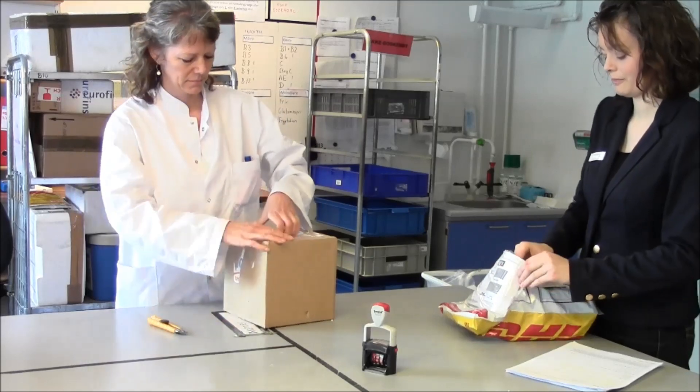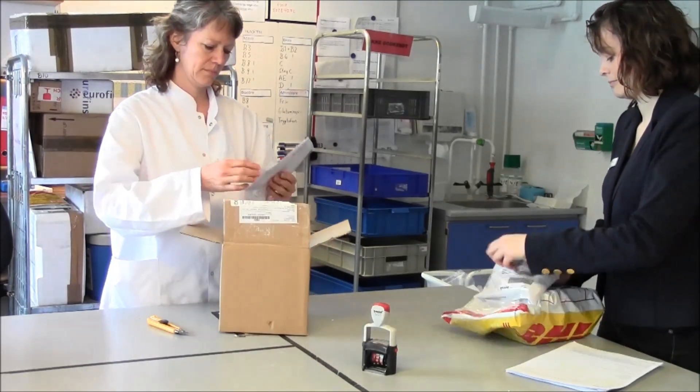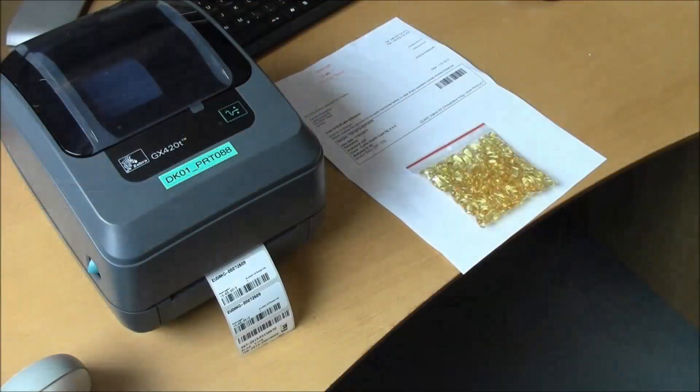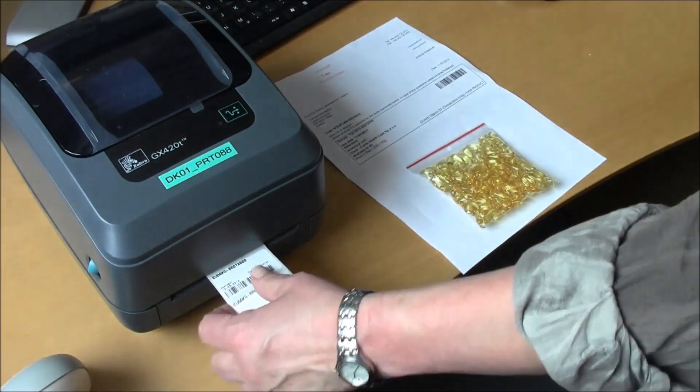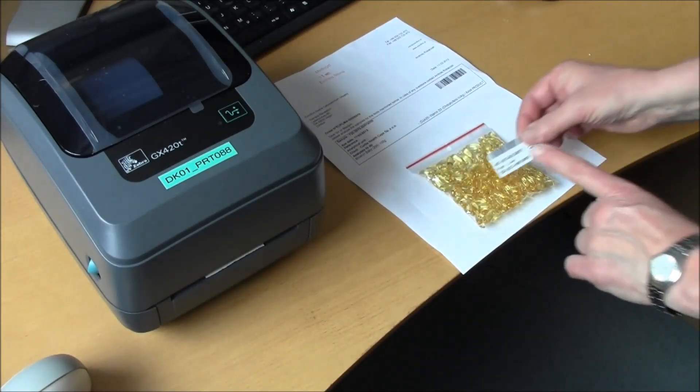Every package is opened and the content is checked with the order note. An analytical service manager is always participating to make sure special requests are met. The samples are then registered and marked with a unique sample number.